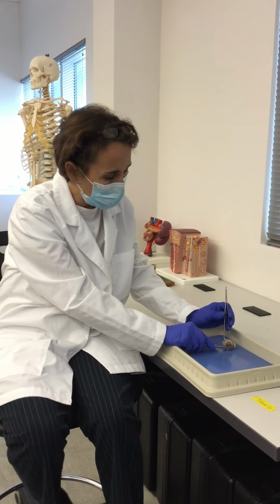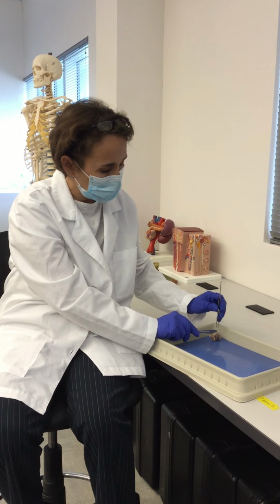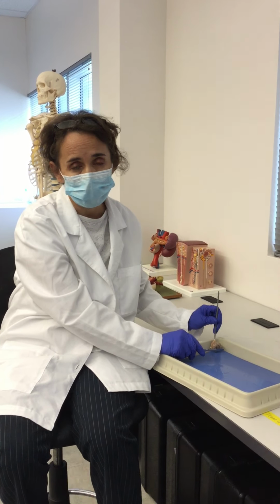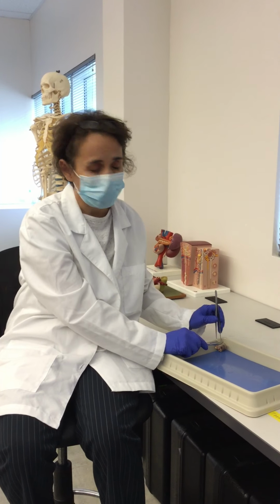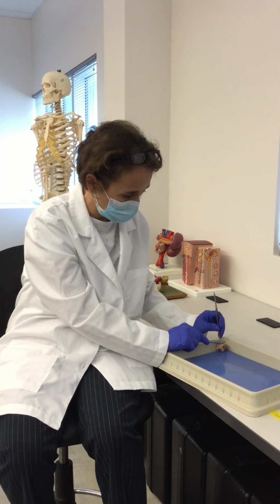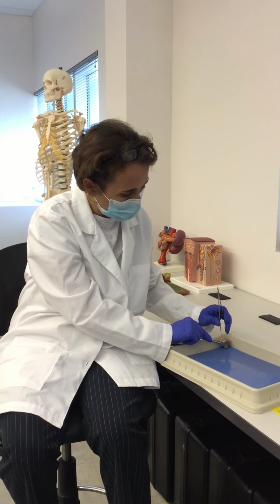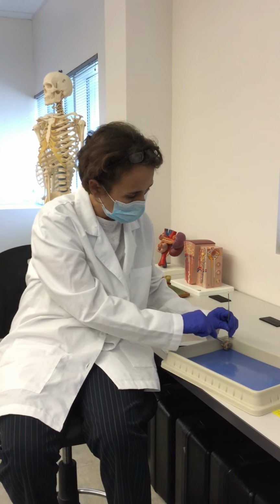Now, I'm still having trouble. One thing about it is that the sclera itself is very tough. That's one meaning of sclera: tough. Like when you have a sclerosis of an organ, that means that your organ is getting thick or tough. So what I'm going to do is put it here in one corner of this dissecting tray to penetrate the sclera, which is very tough.